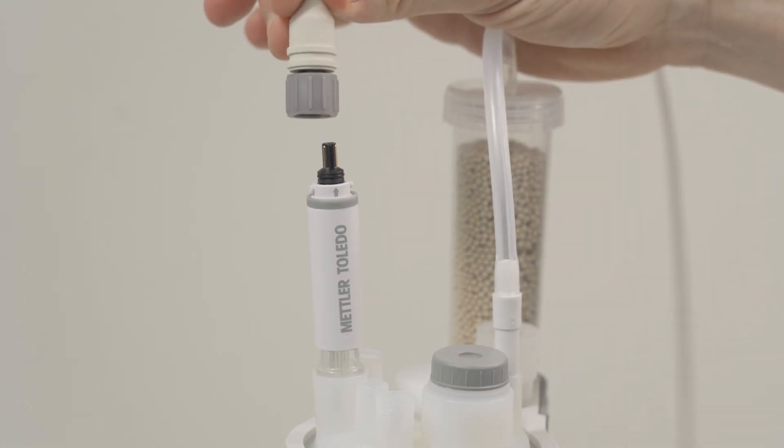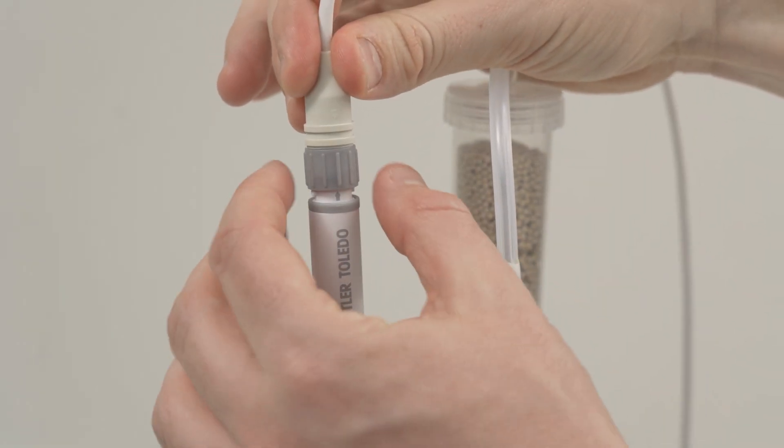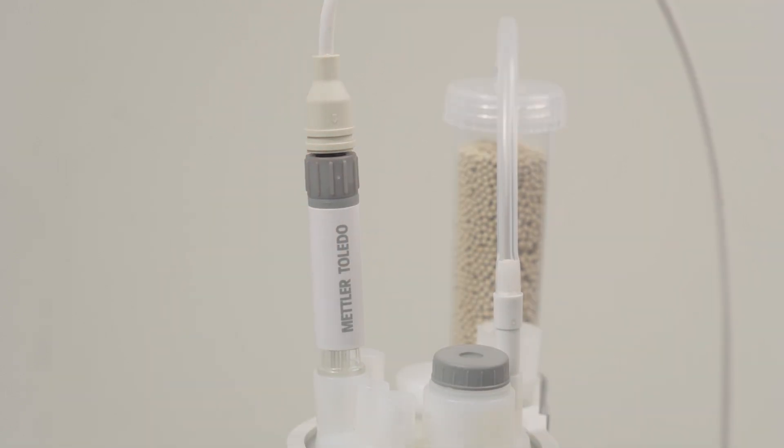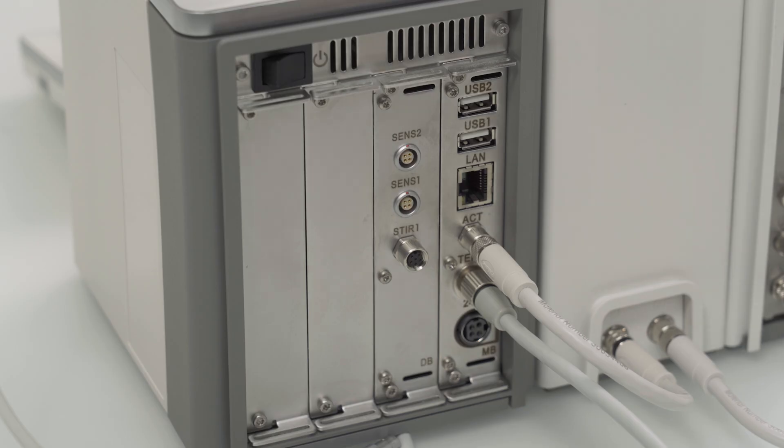Take the sensor cable. Check if the arrow on the white part of the cable and the grey arrow on the sensor are aligned. Push it in and fix it by turning the grey nut clockwise.